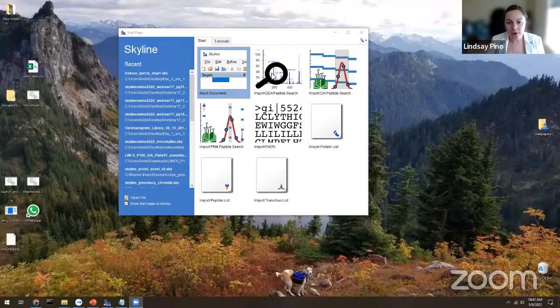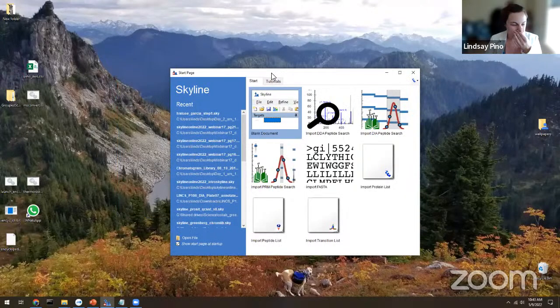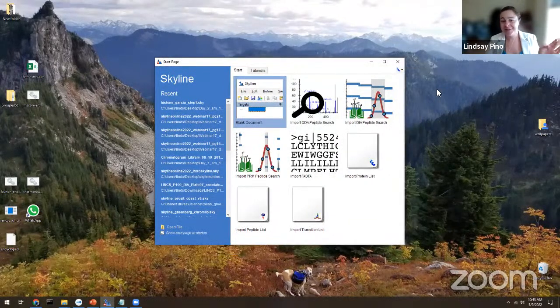Okay, so you are welcome to follow along with me on your own computer, or feel free to just watch me for now. And these are going to be recorded, so you could watch me this time and then do it on your own. Or if you feel good and confident, grab the PDF and just go to town. And you can just listen to me in the background and let us know if you get lost.